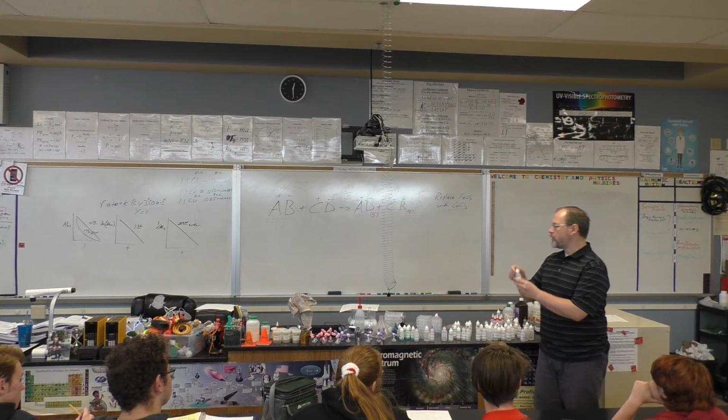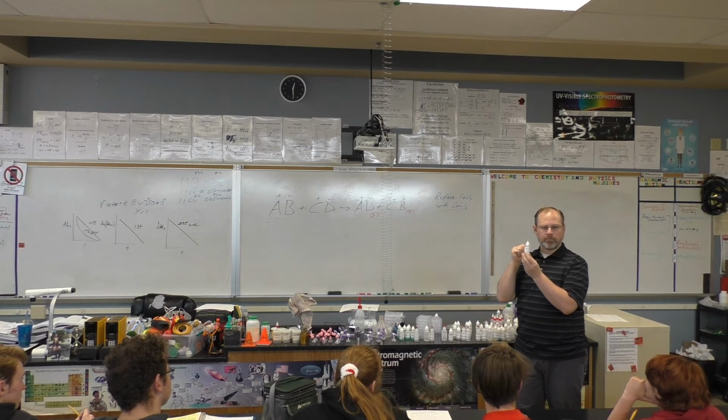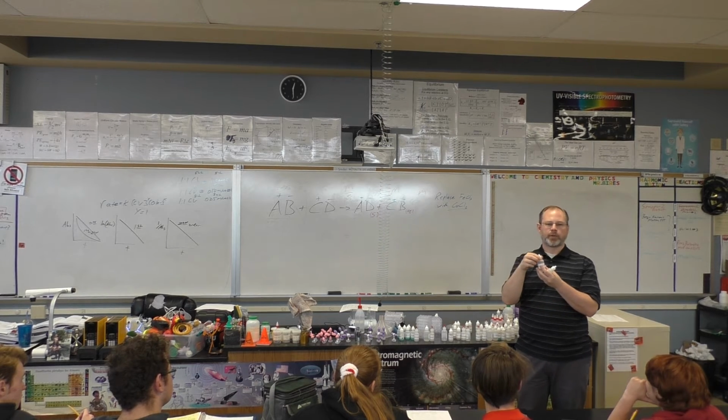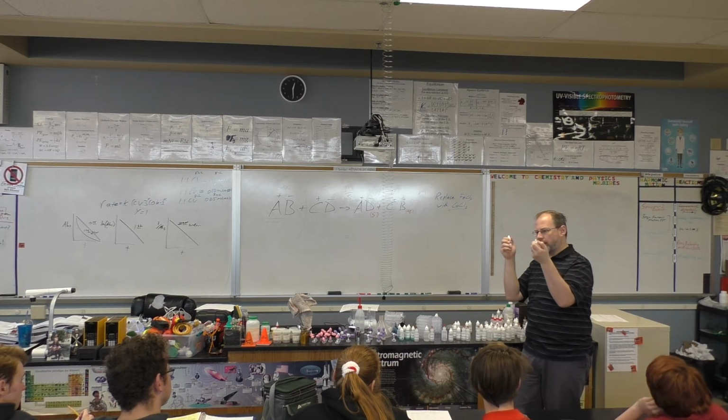Okay? So let's say you take this copper, take the cap off, set it aside. Set it right next to it. Magnesium sulfate, take the cap off, set it right next to it. Okay? Make sure the caps don't get mixed up. Can you handle that? Yeah.